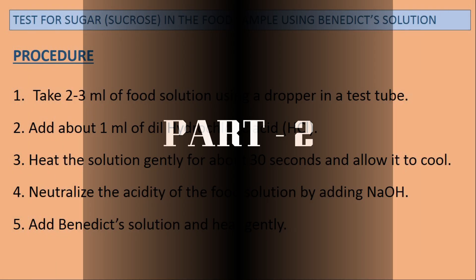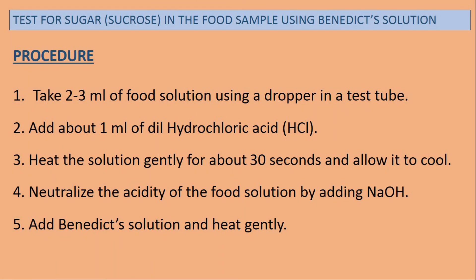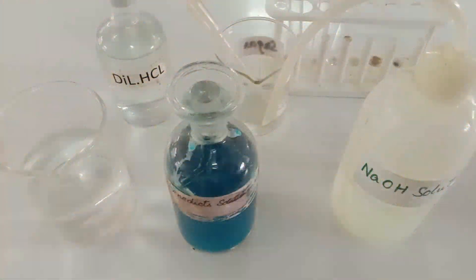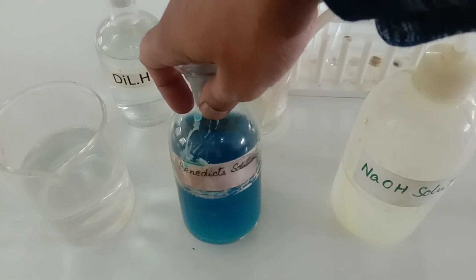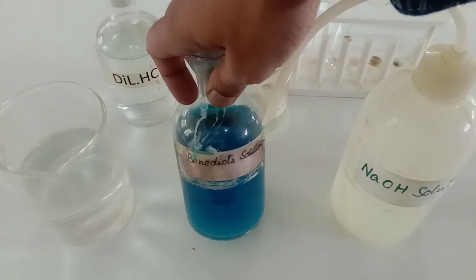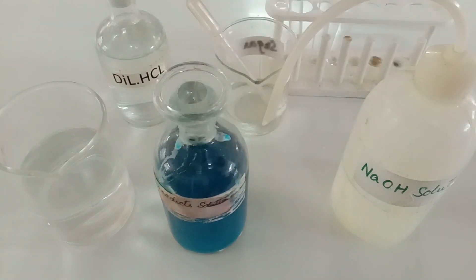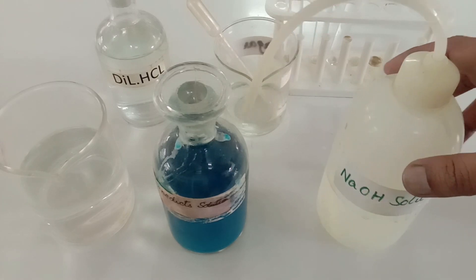There is another test for sucrose sugar in which we are going to require Benedict solution. Here we have Benedict solution, which is bluish in color. We are also going to require NaOH solution.